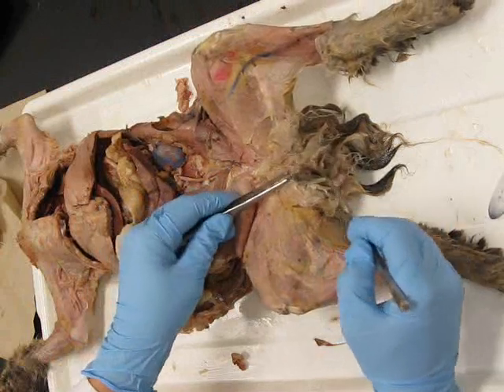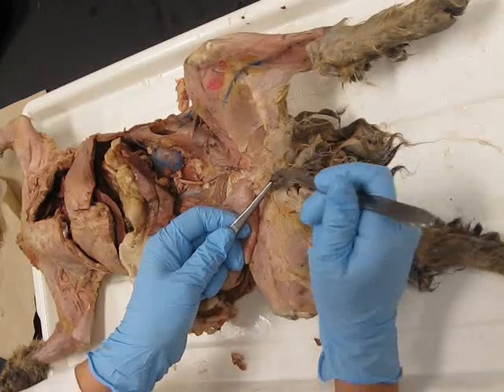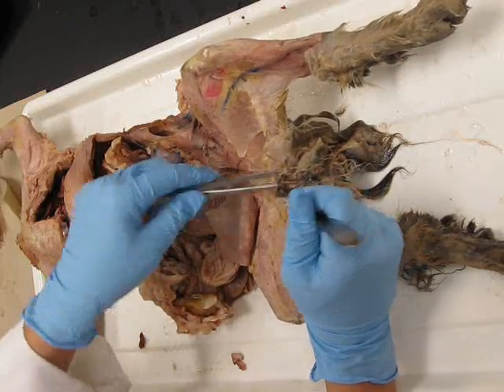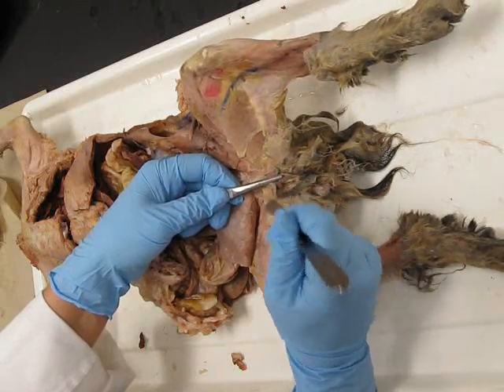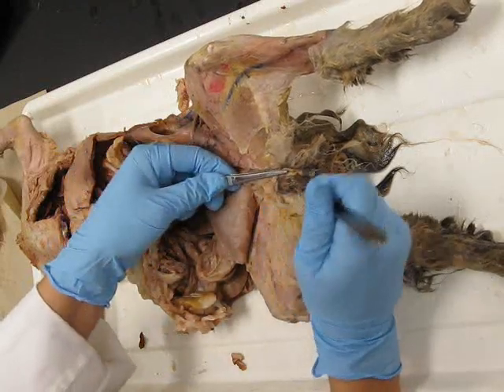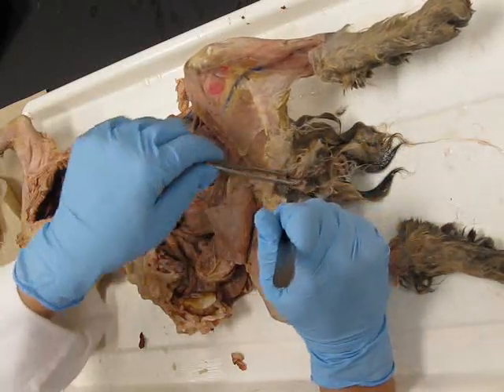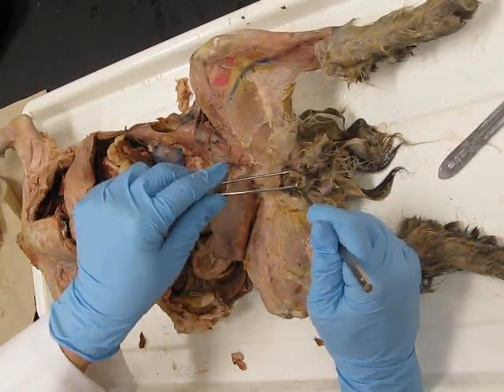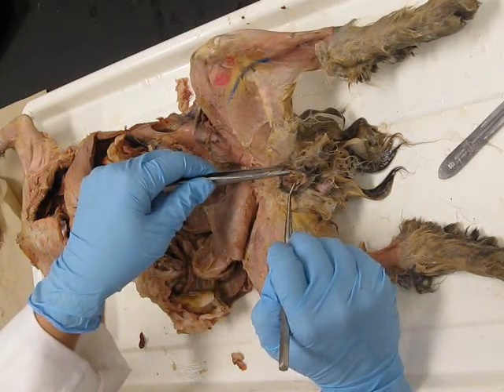Okay, you're also going to dissect the penis, which is inside of a skin sheath in dogs and cats. So you're going to make a careful incision along that. Okay, open that up. Got a little bit more to go. Like this. And there's the glans penis there. A little bit farther. And there you have the penis. Okay, right there. Alright.